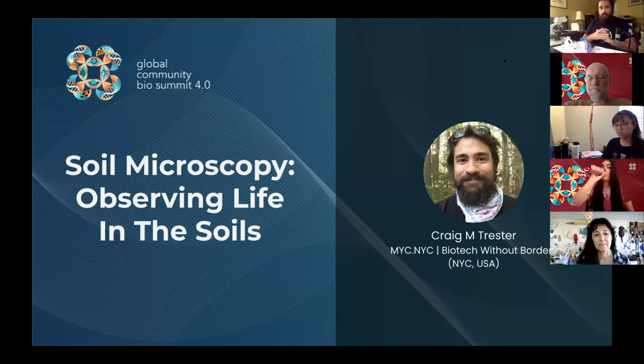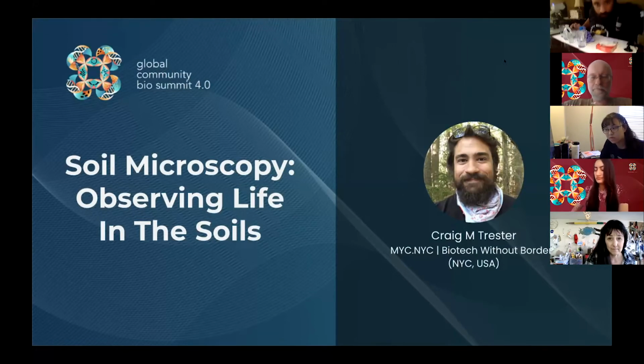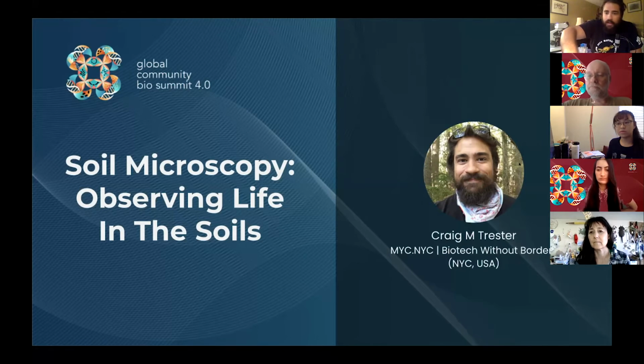Anyway, this is my nice little setup here. I've got a little USB coin microscope, a dissection microscope, and a compound light microscope with a little USB camera in it, so we'll be switching back and forth. For the start of this, we're just going to get into the slides. Since we have the full hour and the slides are mostly pictures, if you want to ask questions, I'm going to stop twice during the first presentation part for questions about the new information. Once we get into the actual soil microscopy component, we'll keep it nice, easy and free flowing. All righty, here we go.